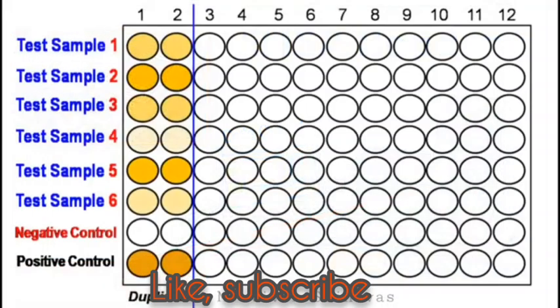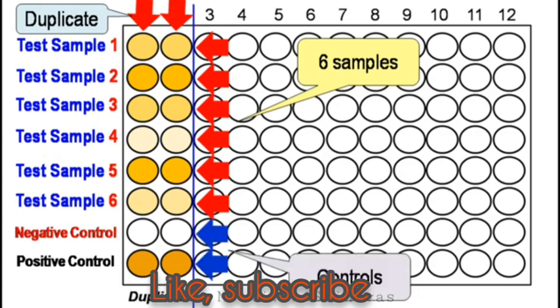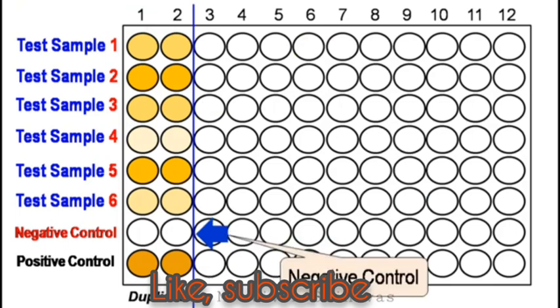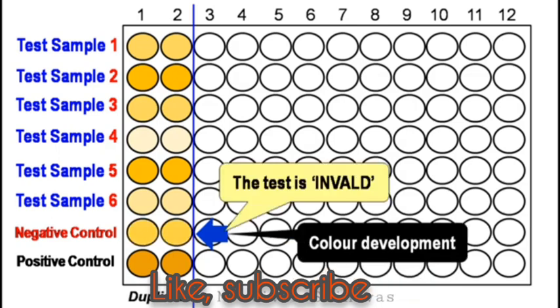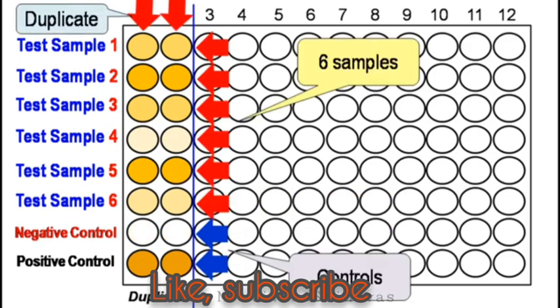For example, in this test experiment, 6 test samples, in duplicate, were run, along with positive and negative control. Control is very important for this test. In the positive control, there should be color development. But, in the negative control, there should not be any color development. If it is vice versa, or any color development in negative control, then the experiment carried out is invalid. In this case, the test has to be repeated. So the control is very important for this experiment, and also for the interpretation of results.